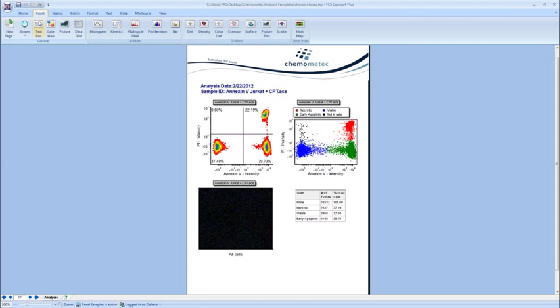And what this lets us do is these tokens, if I want to insert a text box, we can actually grab these tokens and drag them anywhere else in the software into a text box. And we can say the upper right quad % is, and then we have a text box describing what that quad percentage is. Now the really nice thing in here is that these tokens update anywhere that they are within the software. So if we make changes to this, that token is going to update in real time, as you see here. And if we were to change the data in the batch process, which I'll show you in a few minutes, all these statistics are still going to update in real time for you.